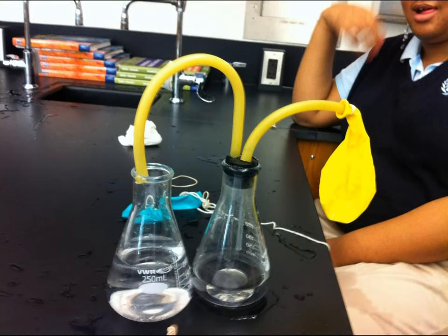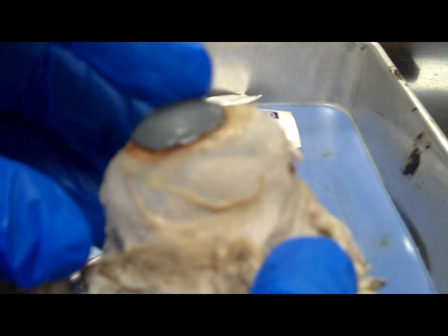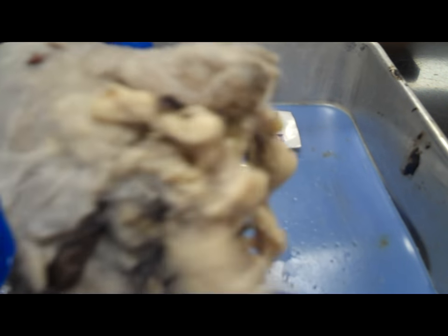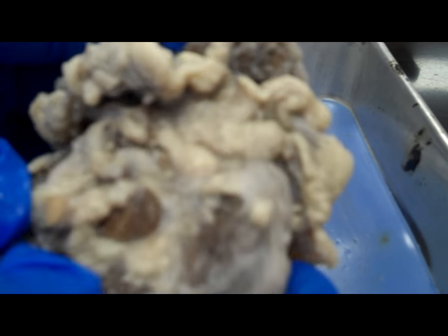I'm Pisgah Science and this is the eye dissection. We're looking at the beef eye and examining its external anatomy.